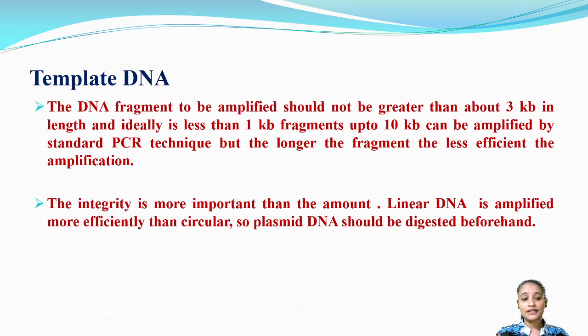So linear DNA is amplified more efficiently than circular DNA. So plasmid DNA should be digested beforehand.